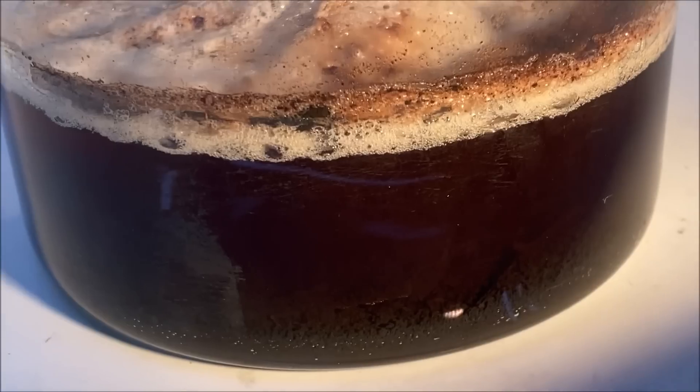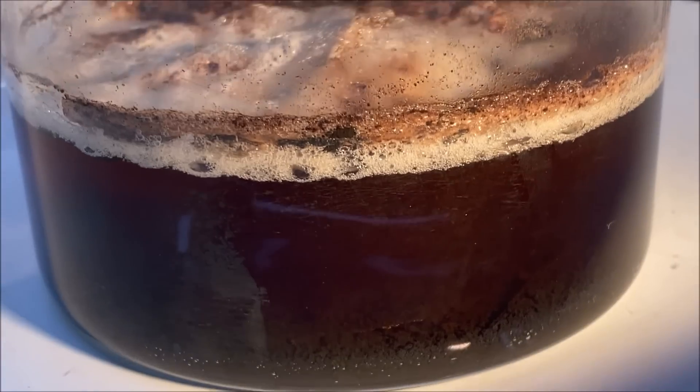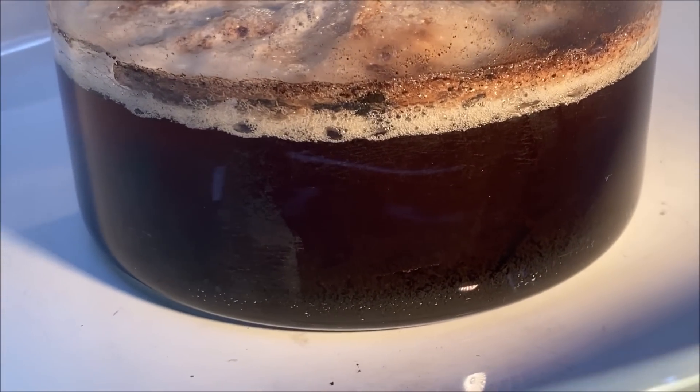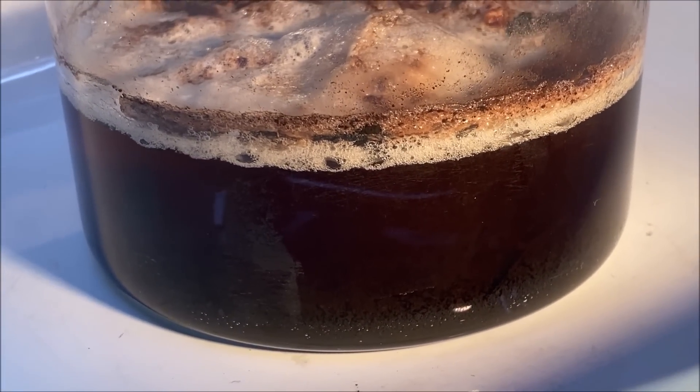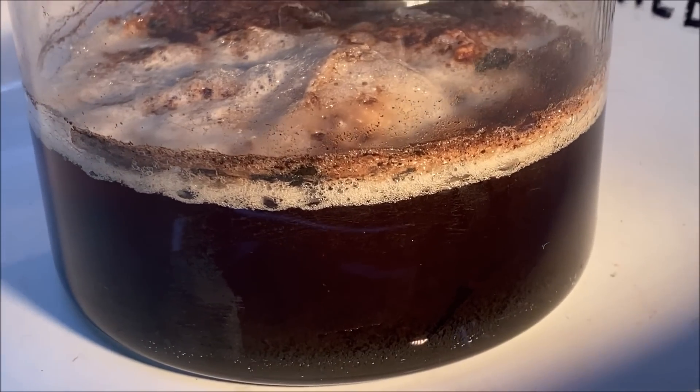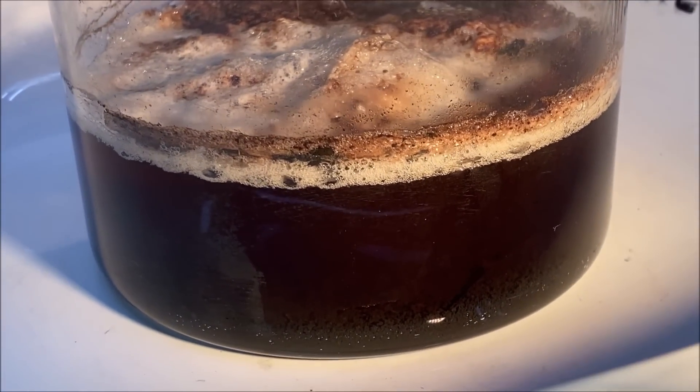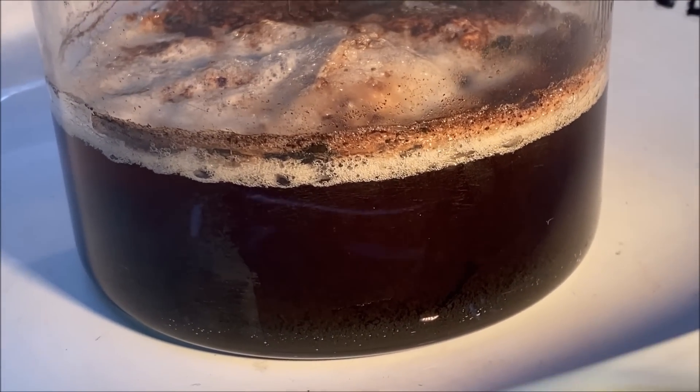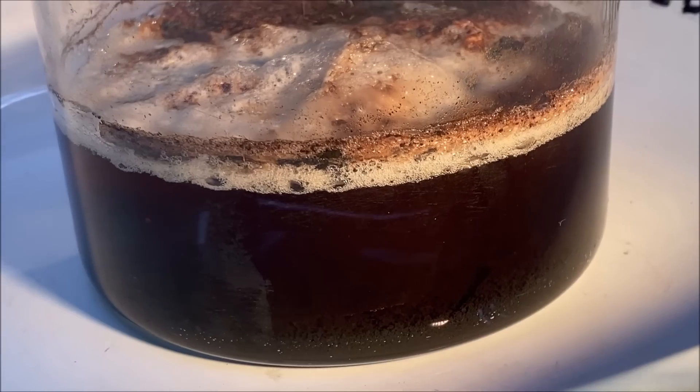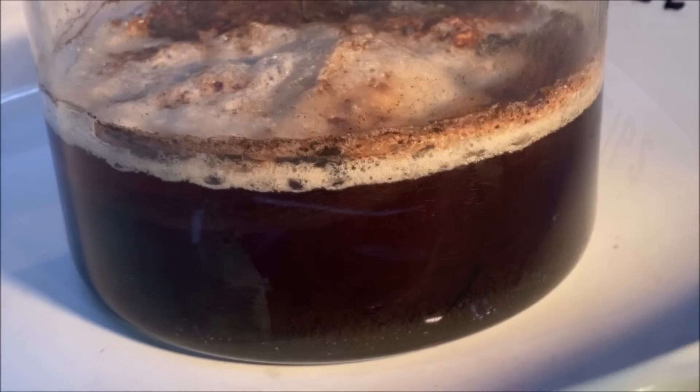But if you notice the color of the solution has turned back to an amber, red, brown color. That means that some of the metals have gone back into solution. This is one of the baffling features of platinum group metals. If you leave them set in that solution they will want to go back into solution, redissolve.